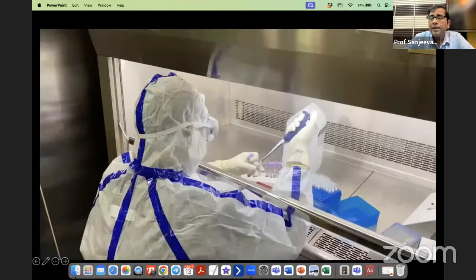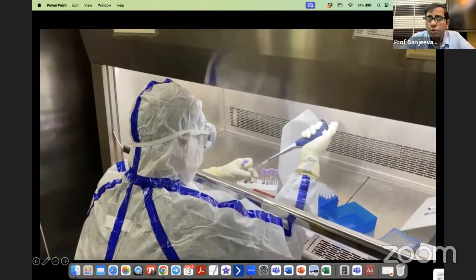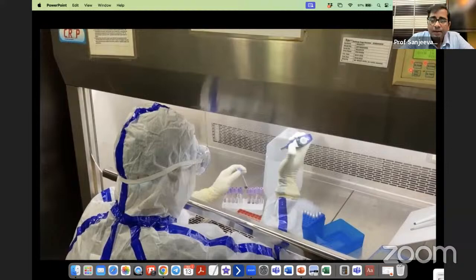All right, this was one of the types of extraction methods. But as I said, depending on the context, one could try different things. Now, let me walk you through plasma proteomics.